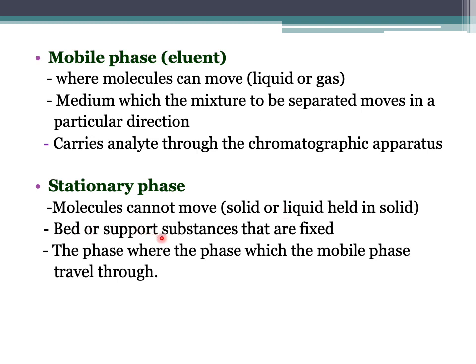So, bed or support substances that are fixed. So, dia fixed sebab ada support daripada solid yang lain. So, the phase which the mobile phase travel through. Dia adalah stationary phase ni adalah satu keadaan yang fixed tapi dia akan dilalui oleh mobile phase. So, mobile phase yang akan bergerak melalui stationary phase.